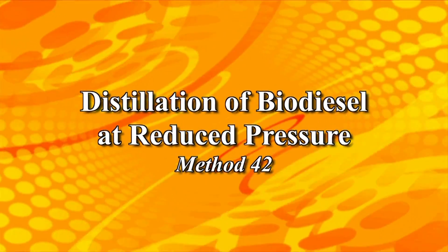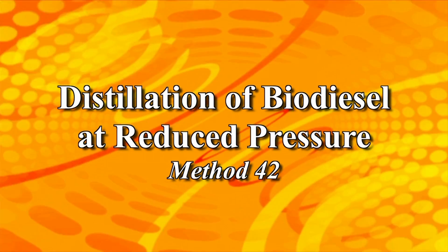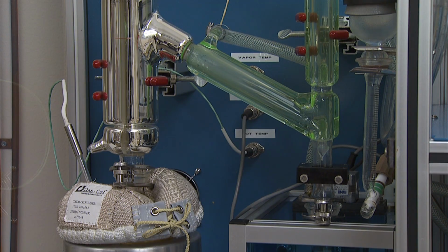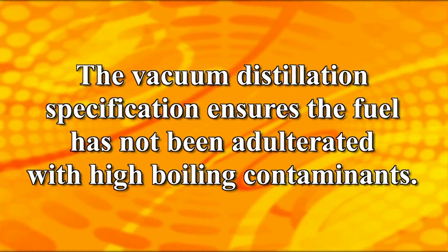This is a video presentation of distillation of biodiesel at reduced pressure, generally referred to as vacuum distillation. Analytical Services Method 42. Vacuum distillation is a process that determines the volatility characteristics of a fuel by gradually boiling the fuel under reduced pressure. The vacuum distillation specification ensures the fuel has not been adulterated with high boiling contaminants.